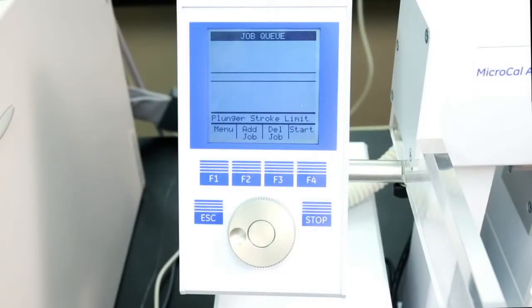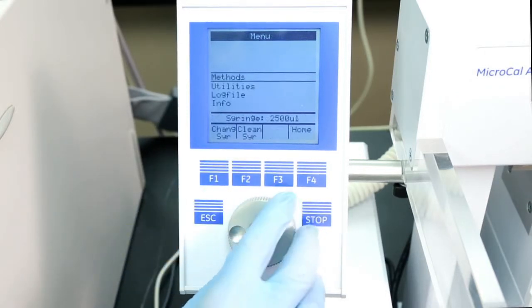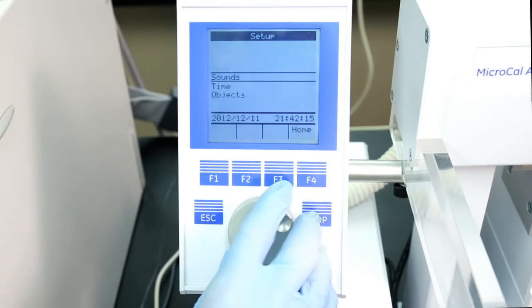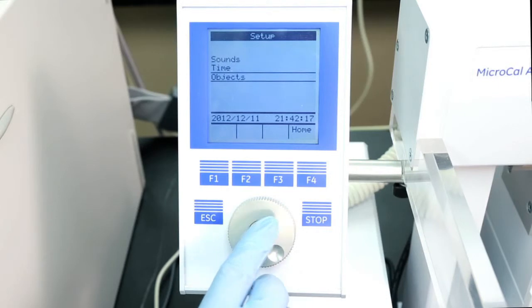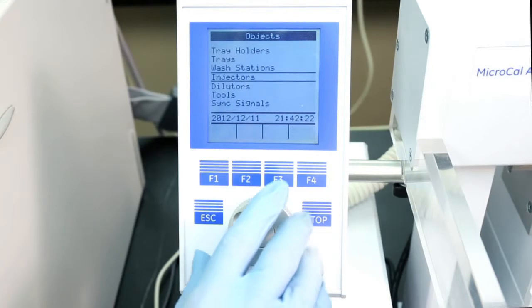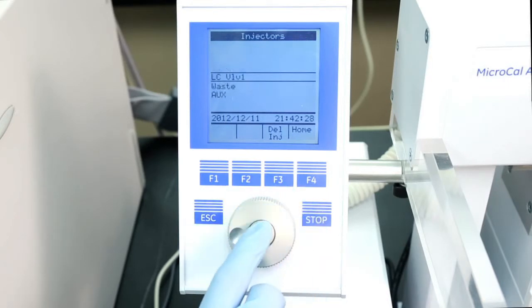Using the accessory console for the autosampler, navigate to the menu by pressing F1, then toggle to setup, followed by objects, then go to injectors, and navigate to LC valve 1. Press Enter.